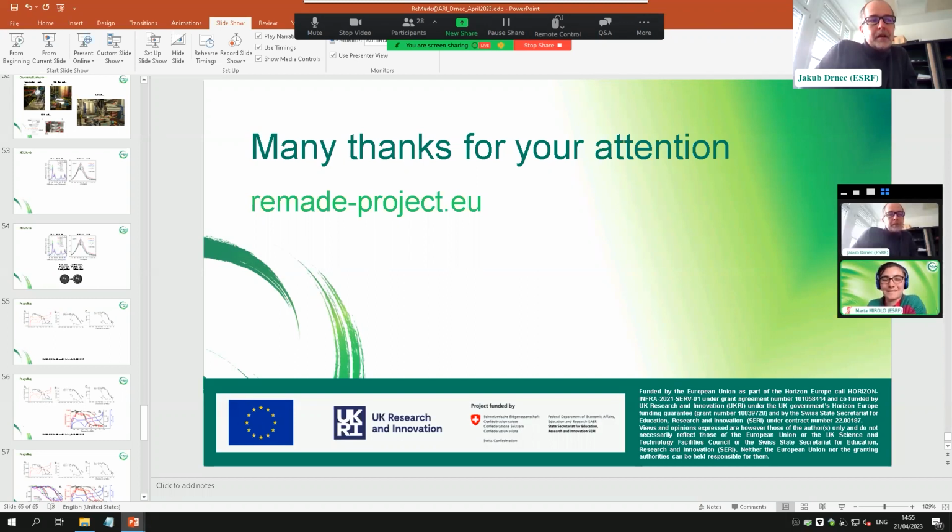We also have another part of REMADE, which is more focused on imaging, right? This is X-ray absorption tomography and imaging of fast processes. That kind of tool is really handy if you want to optimize certain industrial processes or optimize materials, understand the morphology of the materials, how they change, right?